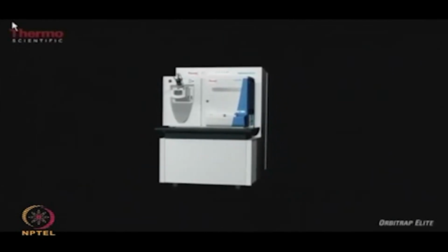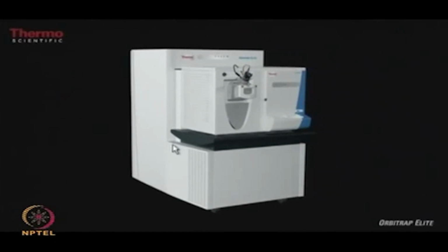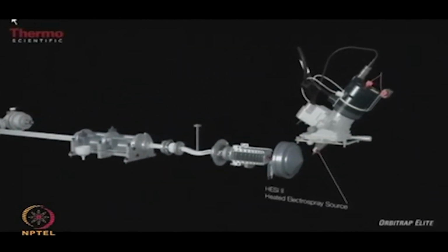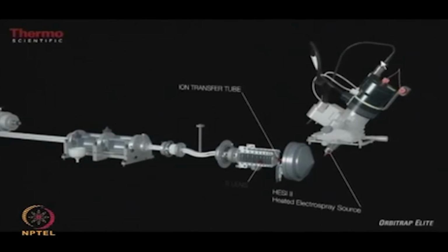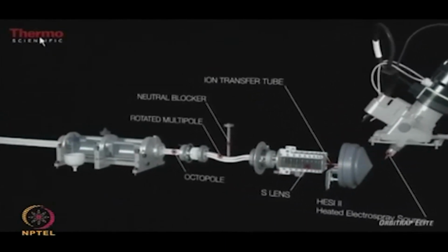Okay. Just introducing the newest technology, the LTQ Orbitrap Elite. The LTQ Orbitrap Elite is a hybrid system which has two mass spectrometers. The one sitting at the front is a linear trap, the LTQ Orbitrap Velos, and the back end is the high-field Orbitrap, called the Orbitrap Elite. If you look at the schematic of the system, at the front is the ionization source. Then you have the transfer optics, and here we have the S-lens, which is the newest generation of transfer optics.